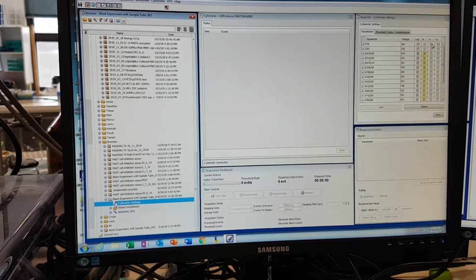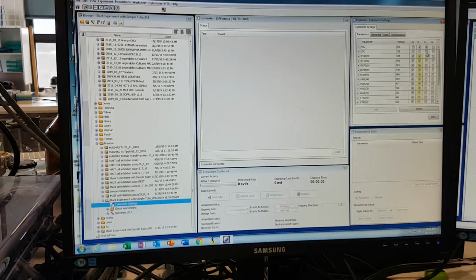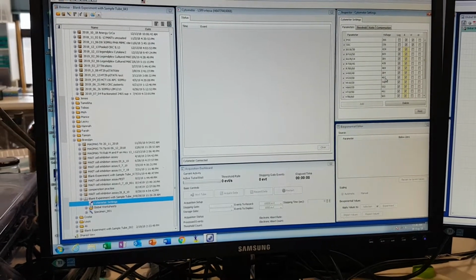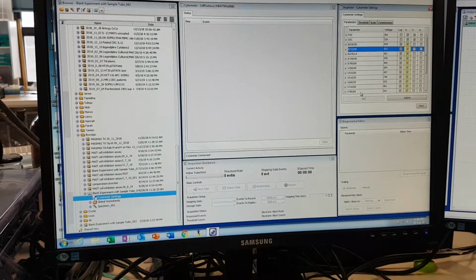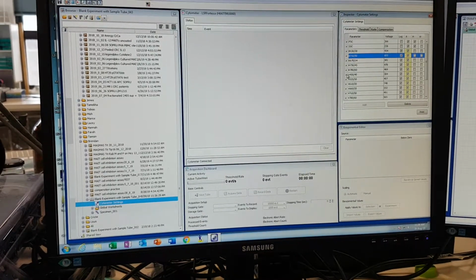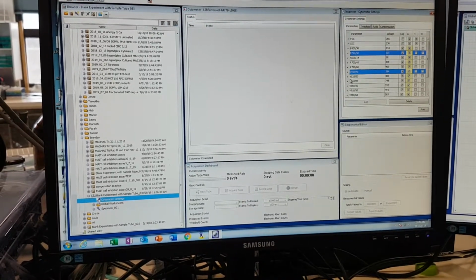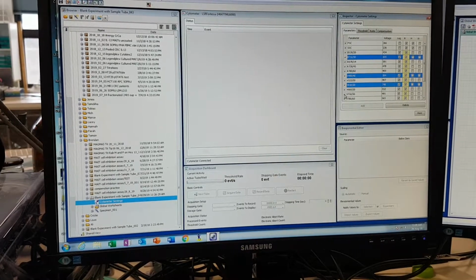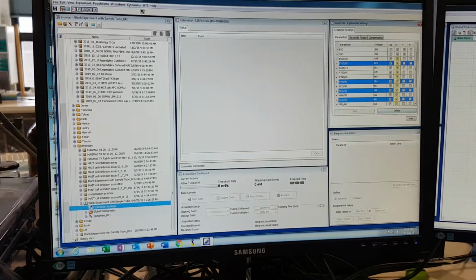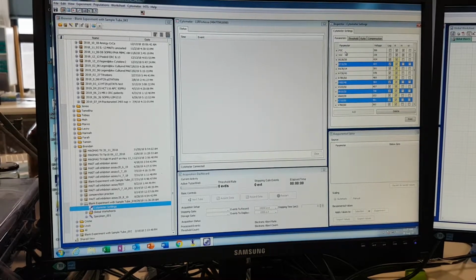First thing you'll need to do is select forward scatter and side scatter height, and then you can start to delete whichever channels you're not using. So if you hold down shift or control and click on the buttons beside it, you can highlight multiple ones and then just delete. So that's one way to create a new experiment.